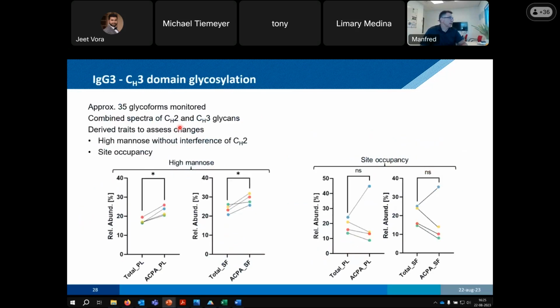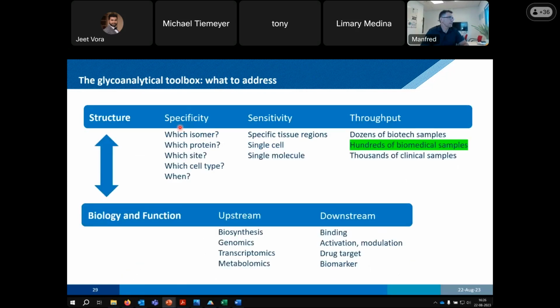Yeah, so this is on the autoantibodies. We are studying these in way more detail. We also look at Fab glycosylation, which I'm not showing here. But what I hope I could demonstrate here is that we can use intact mass analysis, separation techniques, and reveal a lot of features. We can look at proteoforms, different glycoforms, different glycosylation sites, and get a comprehensive overview on the molecular makeup of these antibodies, and in this case, pathogenic autoantibodies.